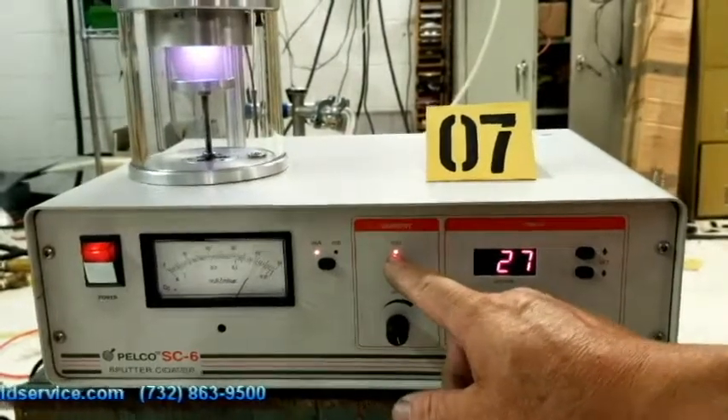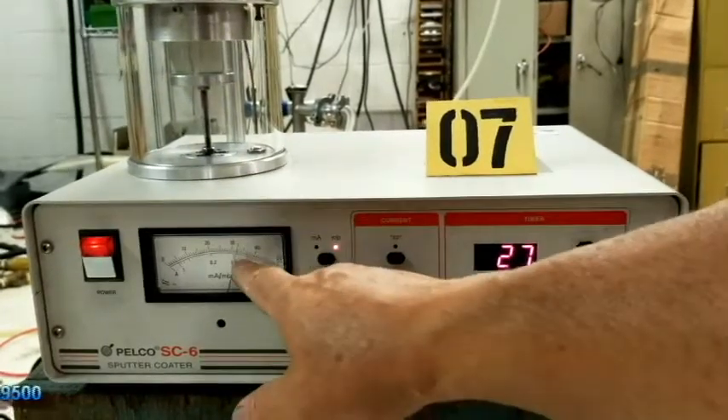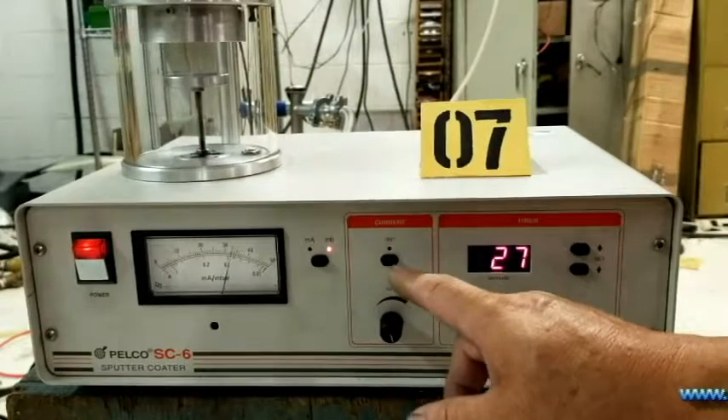You can hit that and you can see that you get plasma up there. Also, in the gauge here, it's reading how many milliamps is being applied to it.